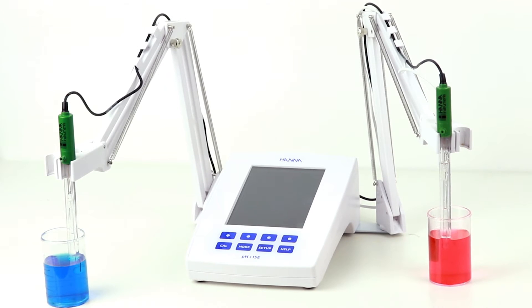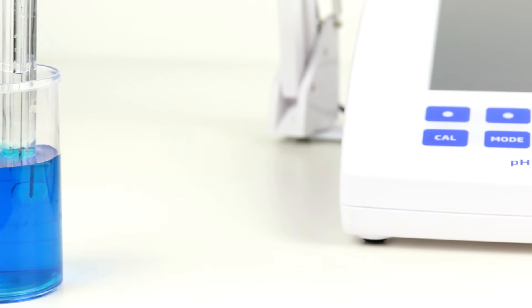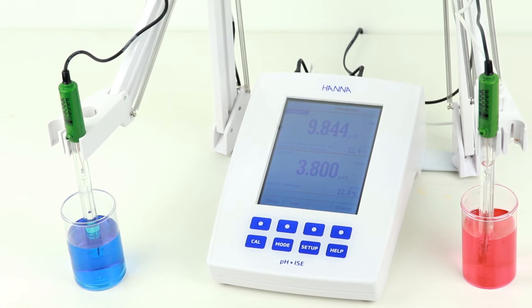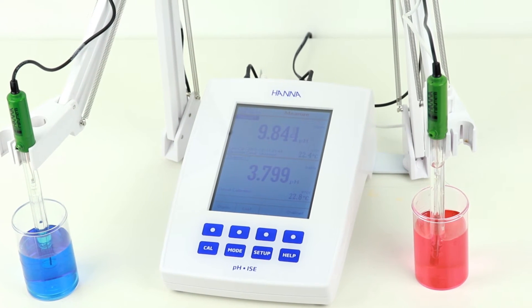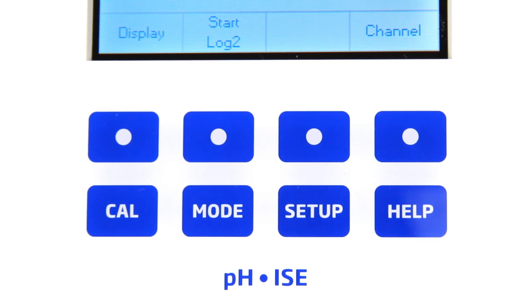The HANA HI5222 PH, ISE, ORP, and millivolt dual-channel benchtop meter is one of our most customizable laboratory meters, featuring a large LCD display and dedicated keys that allow for calibration, setup, measurement mode, and contextual help.